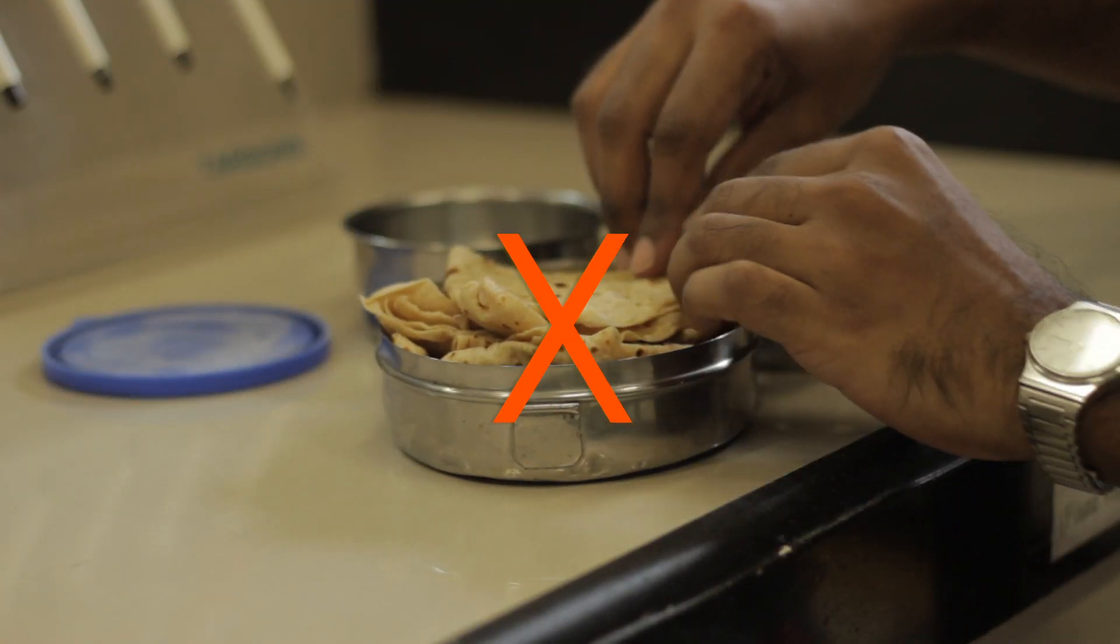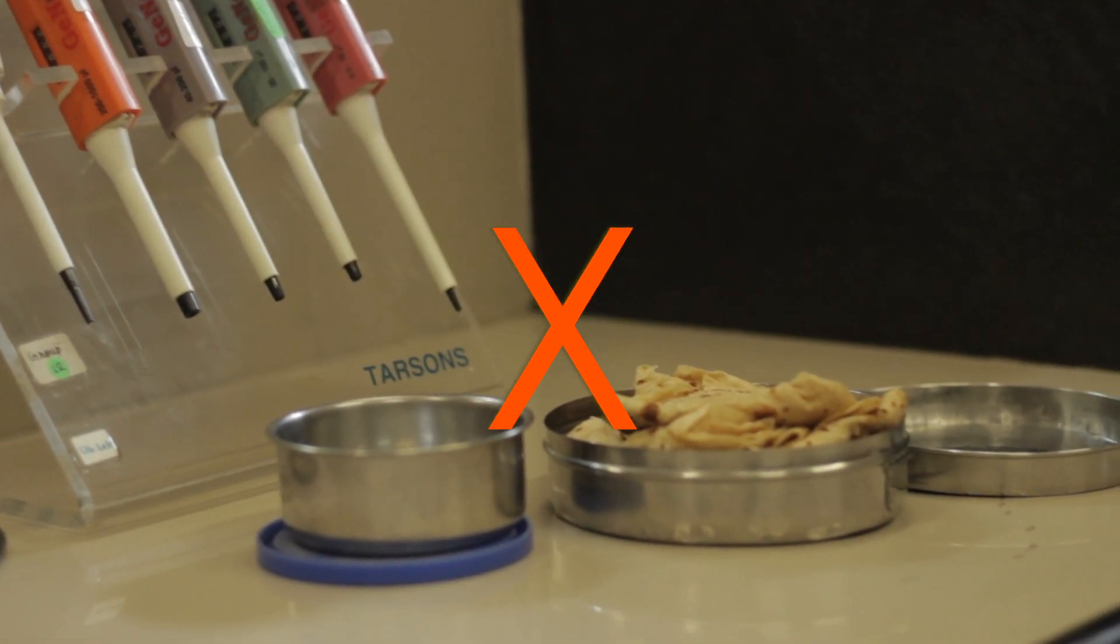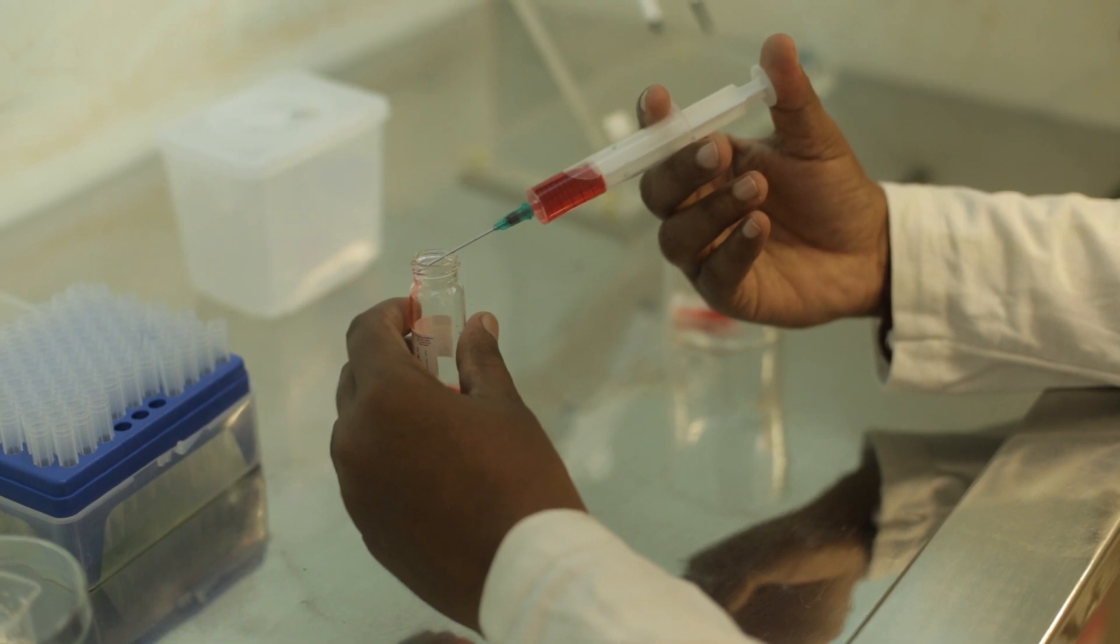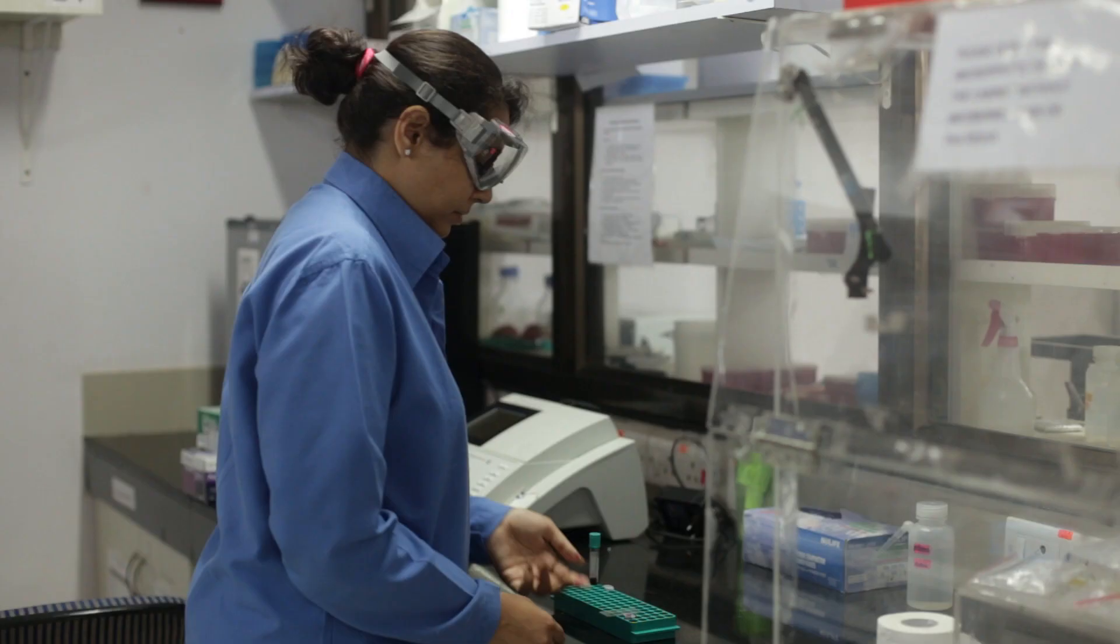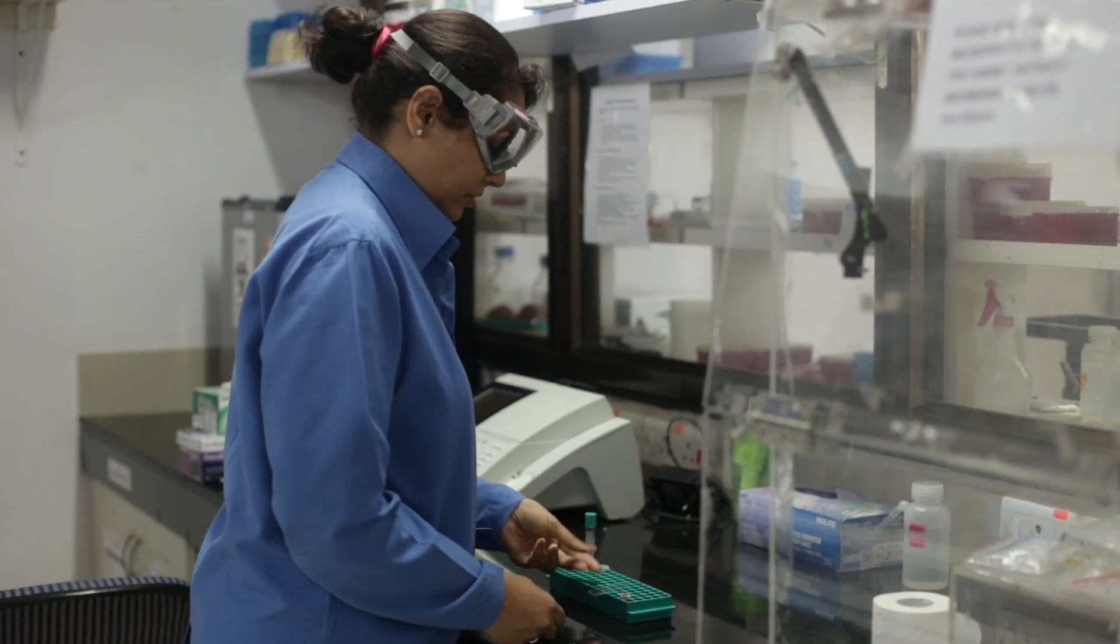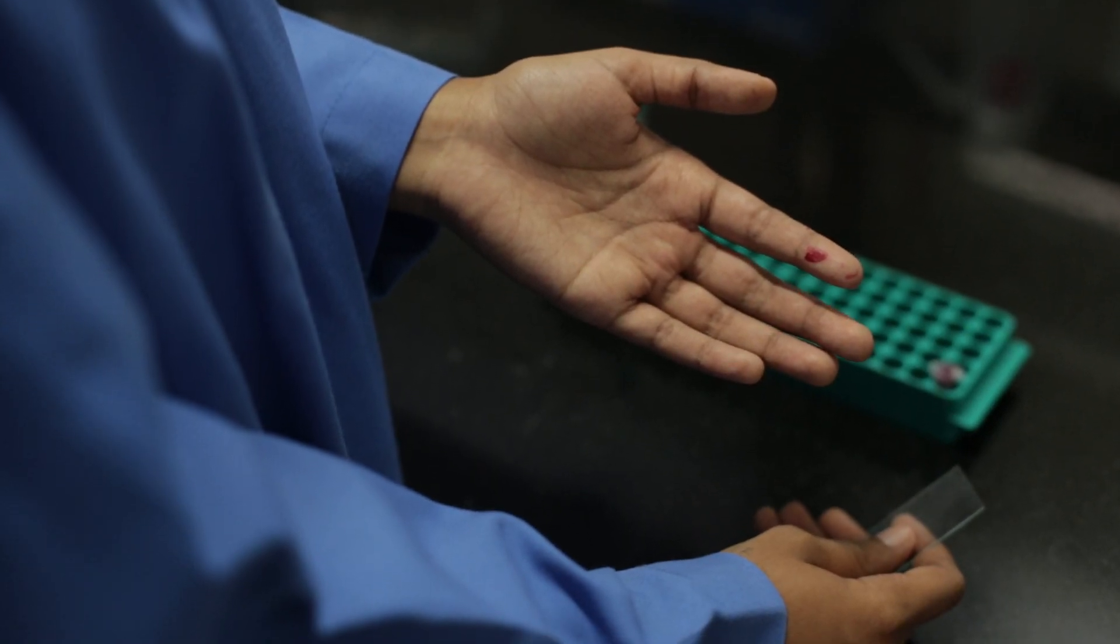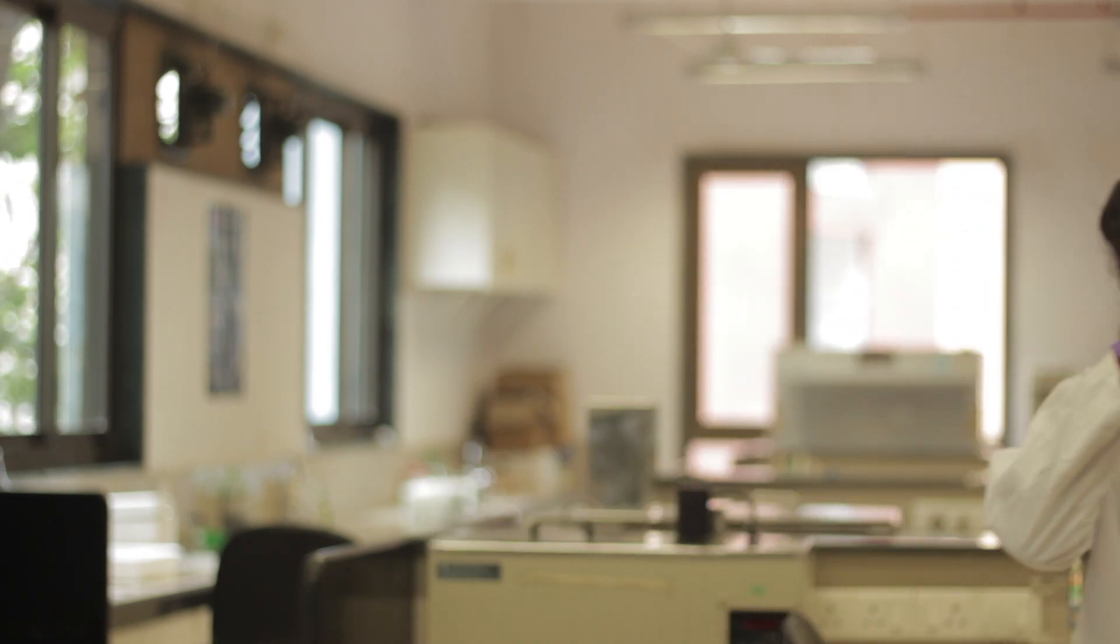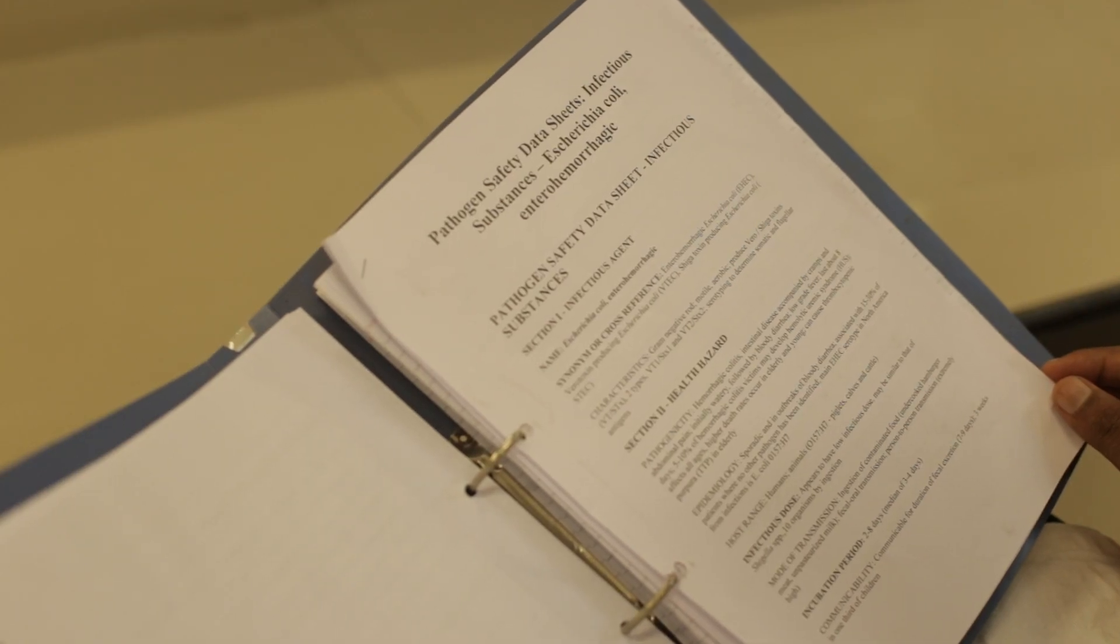Consuming food in the laboratory and not washing hands after completion of work can cause infectious agents to be transmitted orally. Improper handling of contaminated sharps like needles and scalpels can cause injury and transmission of pathogens into the body. Open wounds or abrasions on the skin can transmit pathogens into the body. Splashes to the eyes, nose, or mucous membranes can cause infection if the biospecimen being handled is infected.